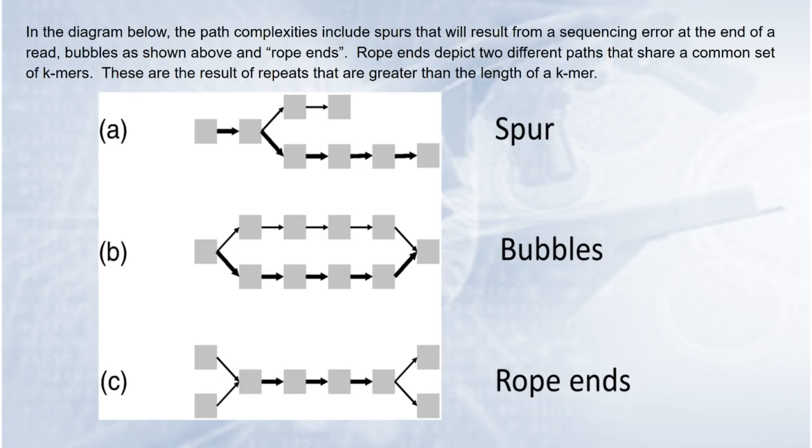These are just some of the path problems that exist. If you think about it, what I've got represented here are some different path problems. And so the one that we just talked about, you could either produce a spur, meaning that you're able to align these KMers into a graph that has a single resolution, except for one spot of it where there's maybe an error or a polymorphism that produces what's called a spur.